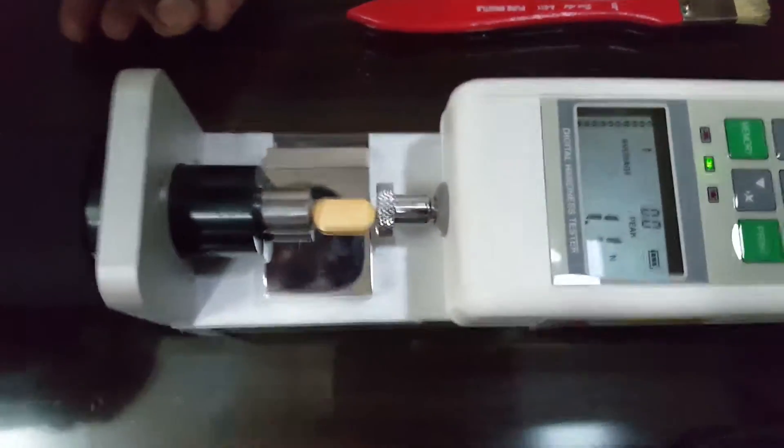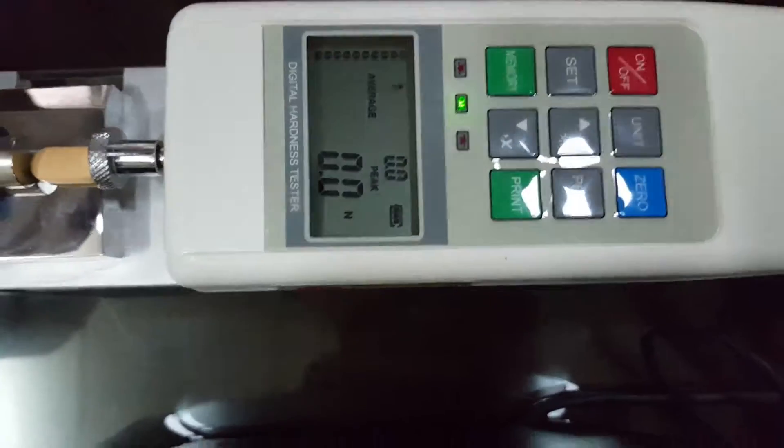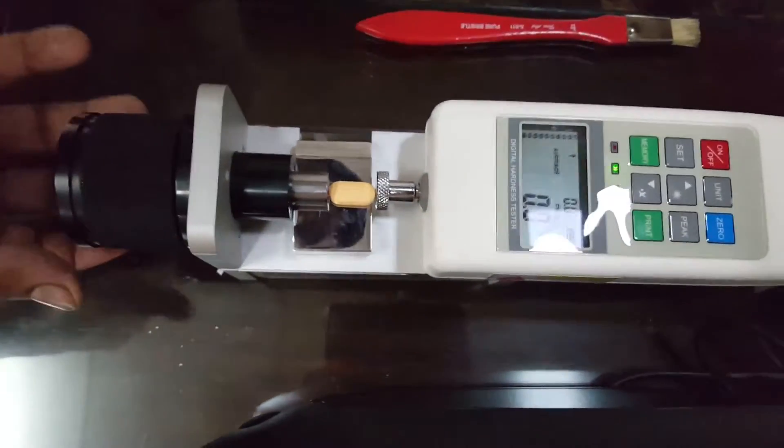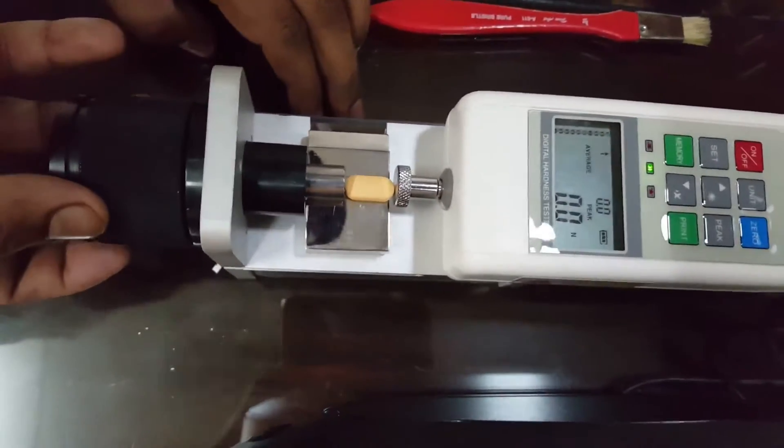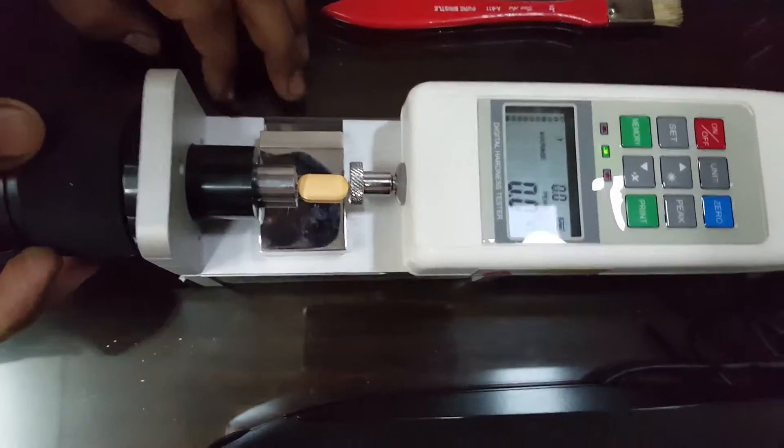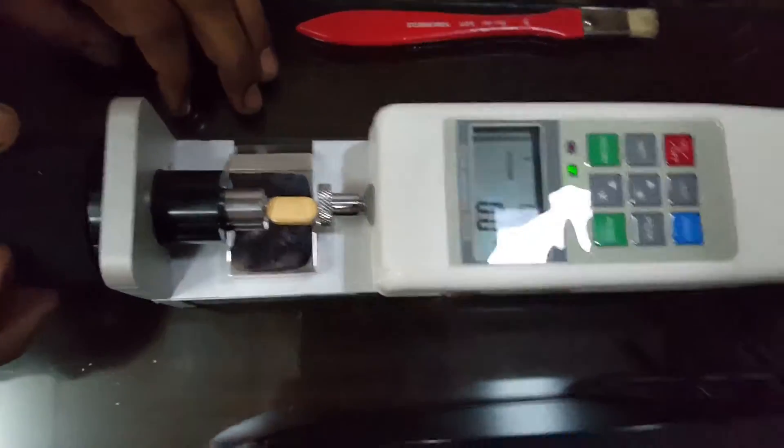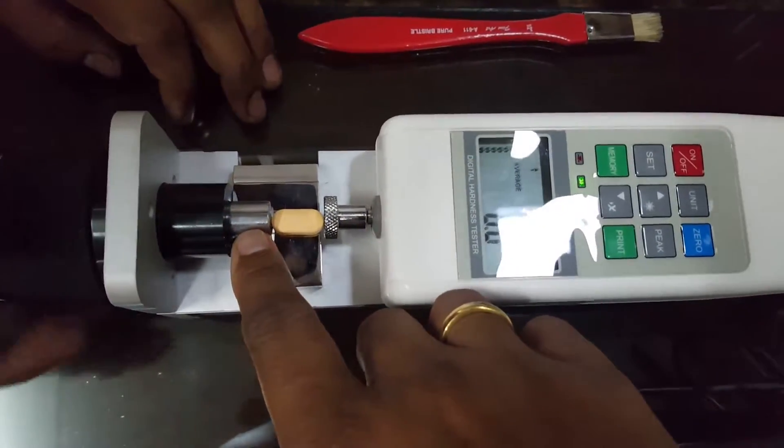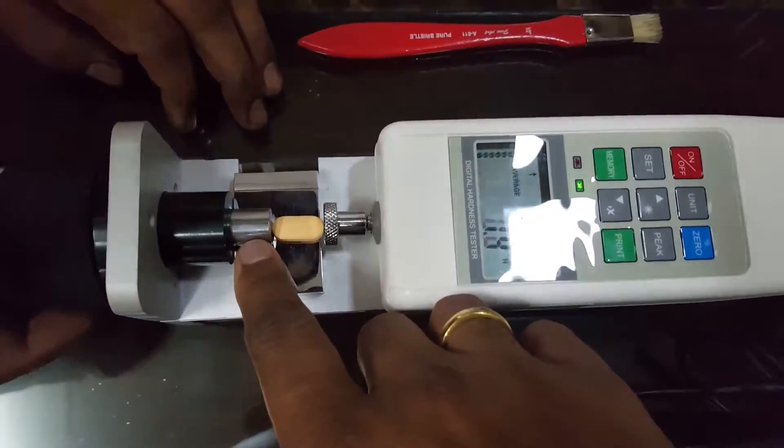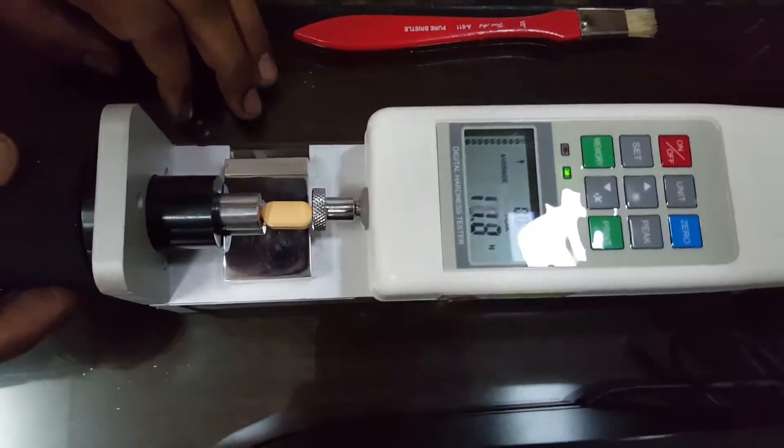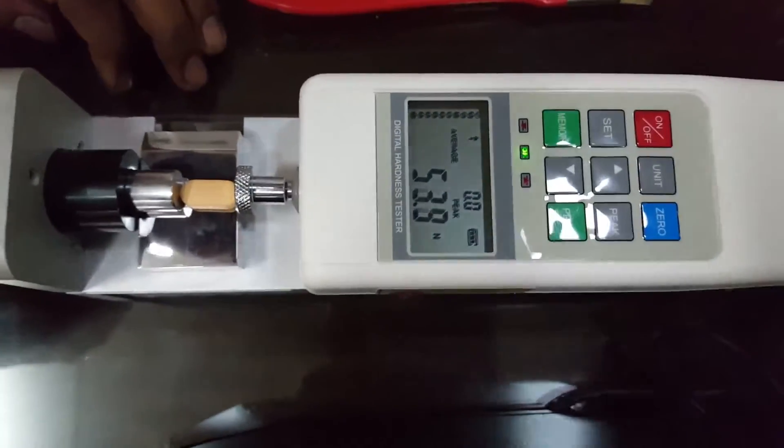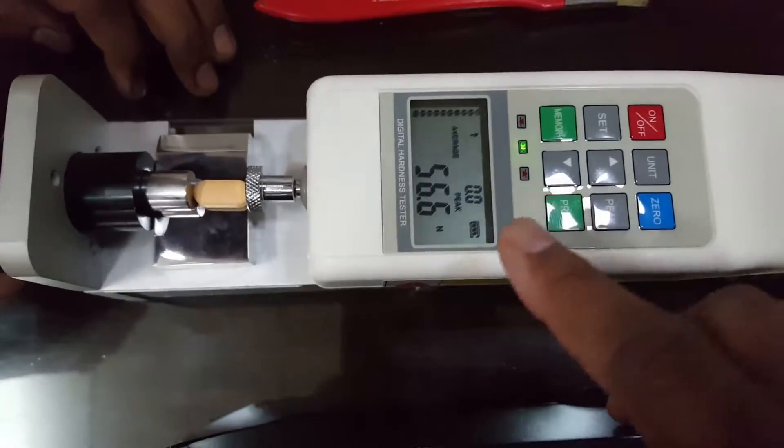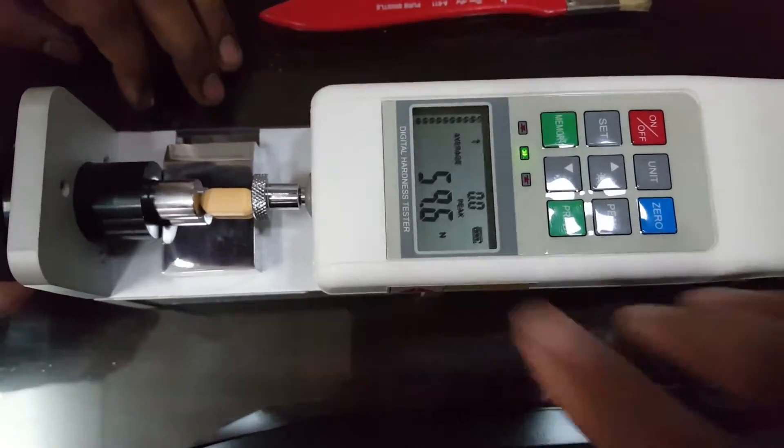Gently place it and make it zero. Now we rotate this rotating knob so that the jaw will move forward to break this tablet and the reading of the hardness will appear on the display.